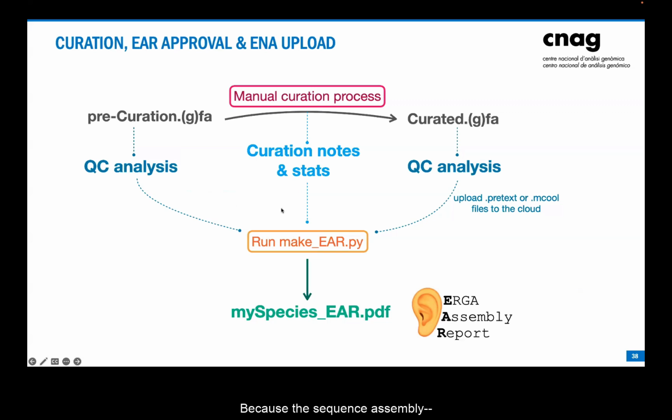And the HiC data is also important for quality control of the assemblies, because the sequencing and assembly committee have put in place this method where we compile different assembly metrics into a single report, and then we share this report together with a link to the contact map with another expert in the field to review our assembly. This way, we have an independent evaluation of how good our assembly is.